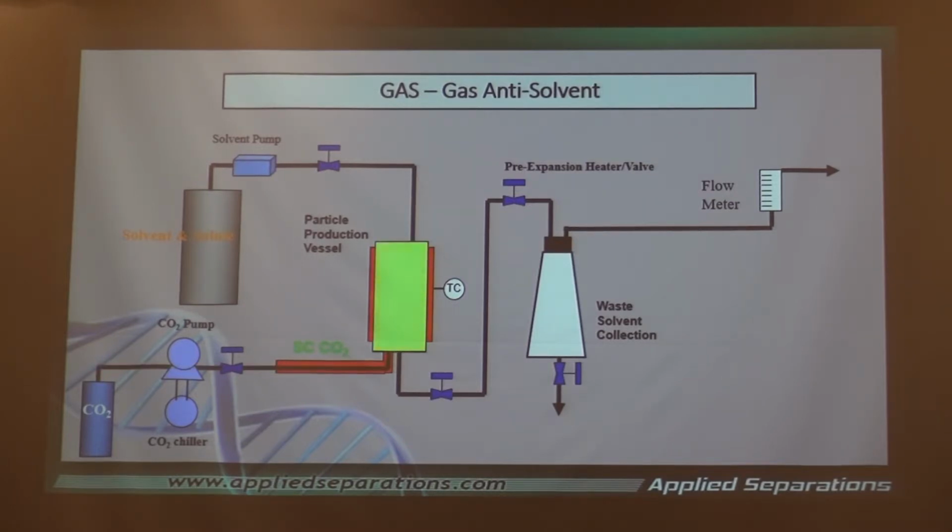And what happens is the solvent will dissolve into the CO2. Now, with it dissolving into the CO2, there is not enough solvating power to keep the solute, that is the particle, in the solution. So it will begin to fall out of solution. Now, I want you to keep in mind one of the very important things that we talked about early on, and Dr. Muckbart told you about this as well, and I've emphasized it over and over: tunability.